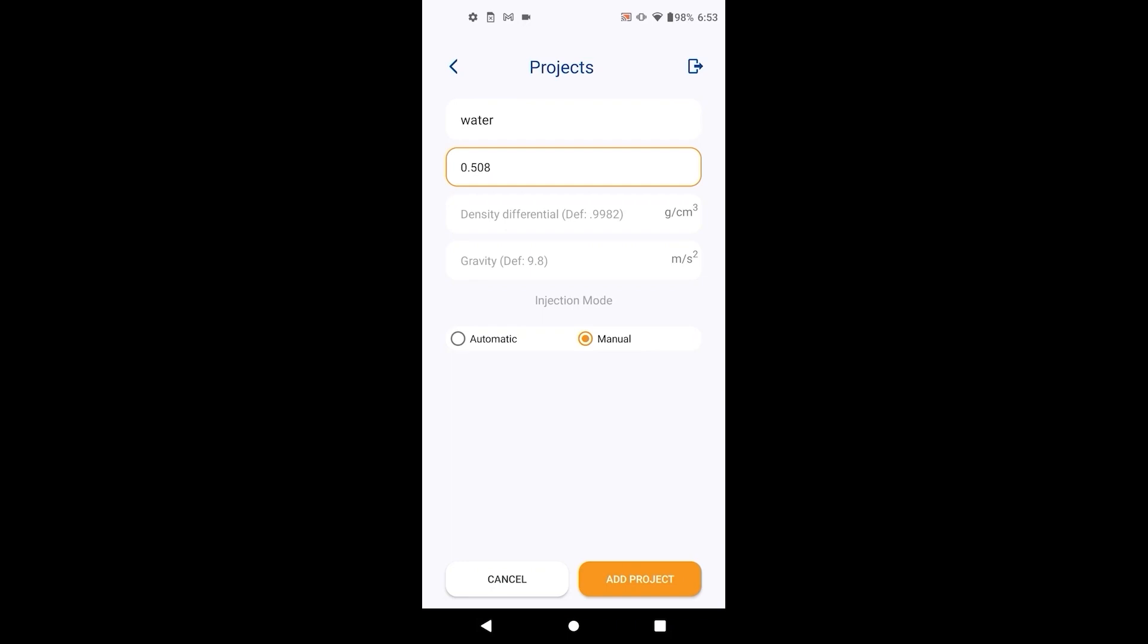And finally, the acceleration of gravity. The default value is 9.8. If you wish to provide a more precise value, you can. Select the injection mode depending on if you ordered the automatic dispenser hardware add-on.